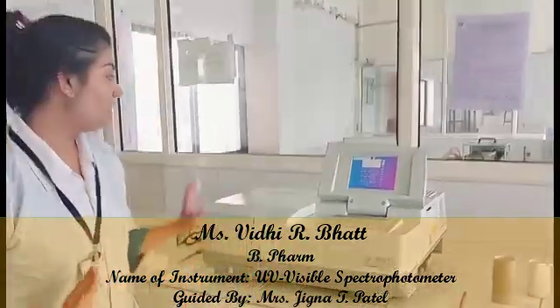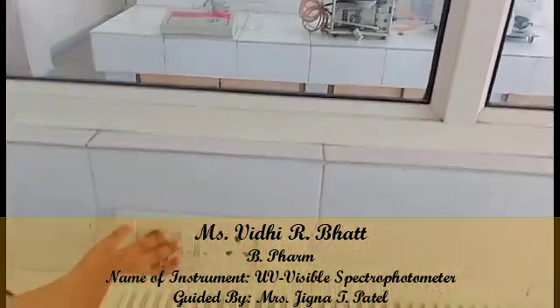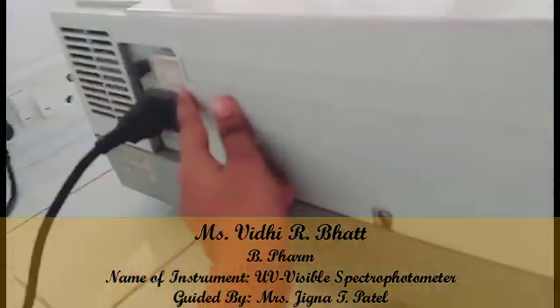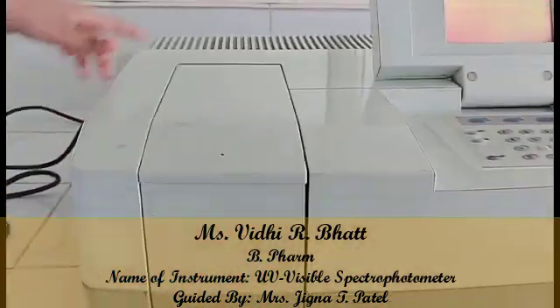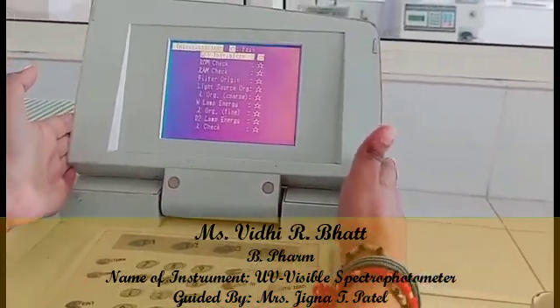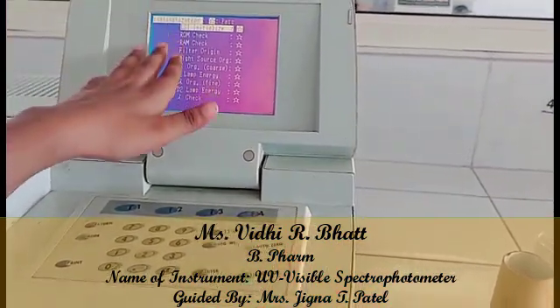First of all, we will turn ON the main switch and the ON switch over here. It will then display the screen which shows the initialization process.